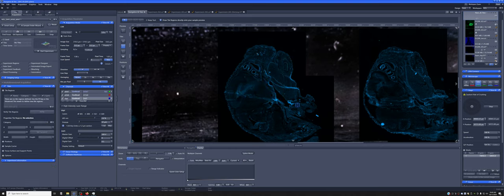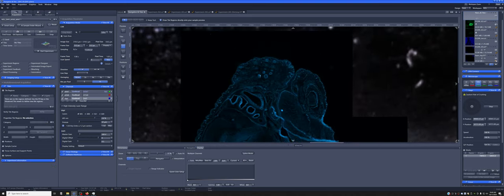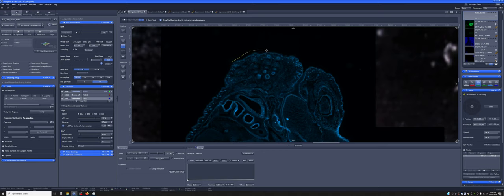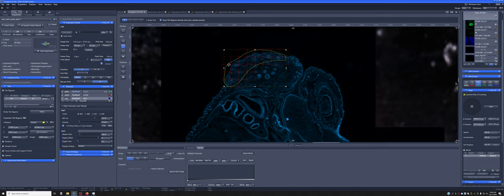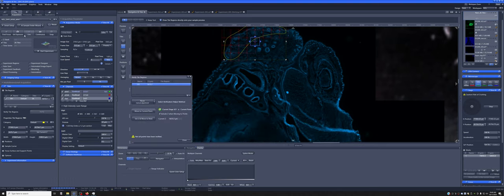So I'm going to delete all of these and maybe make something a little bit more sense. So let's say we want to capture this edge because those round objects are of interest to us. If we do it this way, it will sweep through it like so. And again, we want to verify the focus. I'm going to do that now.